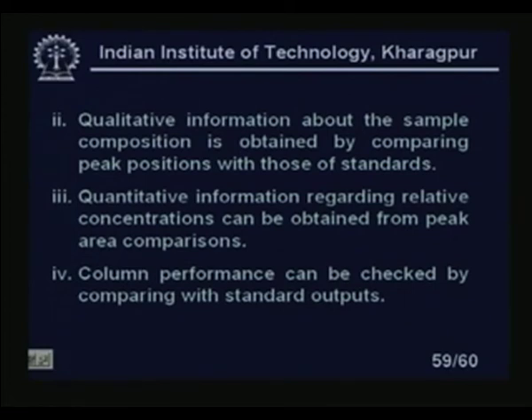Column performance can be checked by comparing with the standard outputs. Suppose I want to calibrate the column performance, I know the particular gas which we are injecting, so that when an unknown gas is coming, I can calibrate how the column is actually working. So the column efficiency can also be known by looking at the chromatograph.